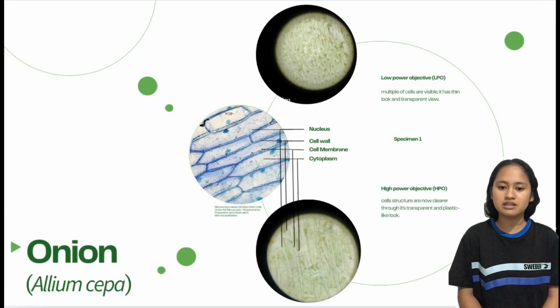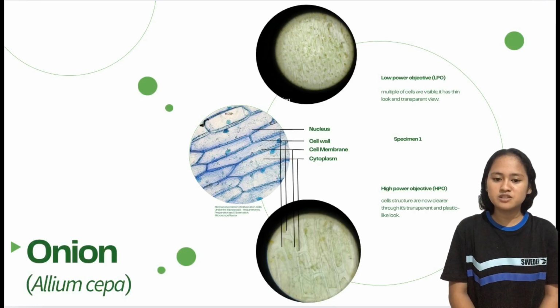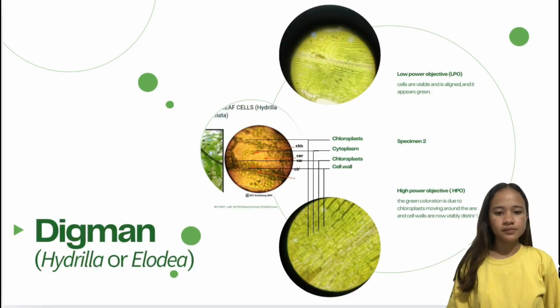Onion cells are a classic example of plant tissue because their clean, rectangular shape naturally shows the cell wall very clearly. The nucleus may not always be visible unless the dye reaches the right area. This is normal for onion epidermis.